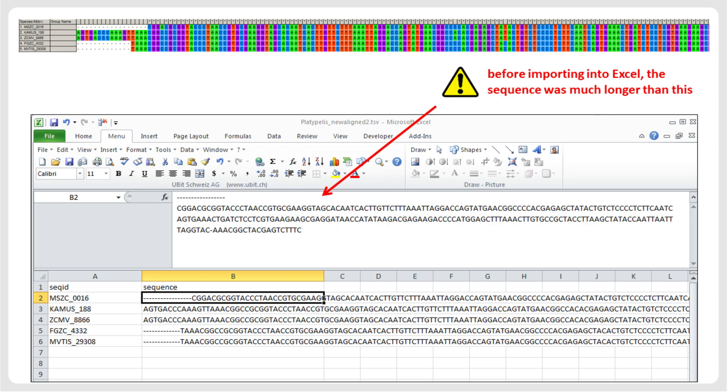Often, the sequence will be trimmed, for example, to 256 characters, which may only be noticed at a later stage, causing a lot of extra work.